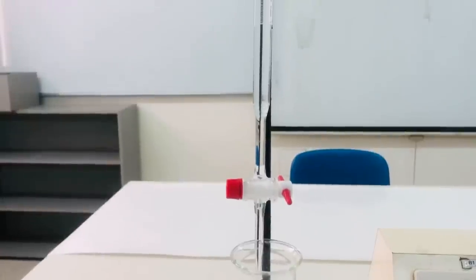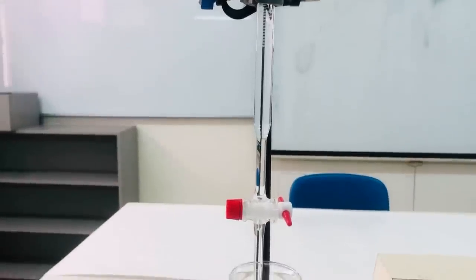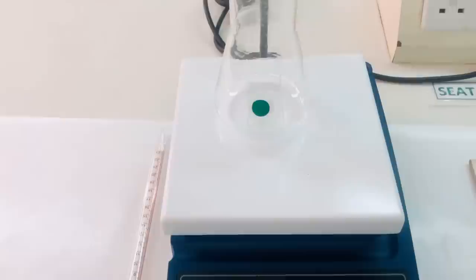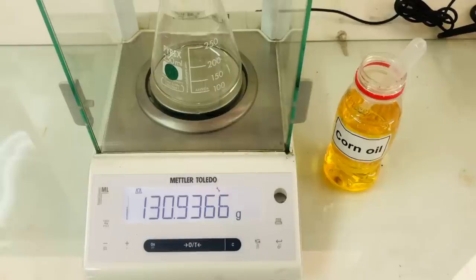Other equipment required for the experiment are burette, burette stand, conical flask, and hot plate. The sample that we have chosen today is corn oil. So we will accurately weigh 5 grams of corn oil in the conical flask.